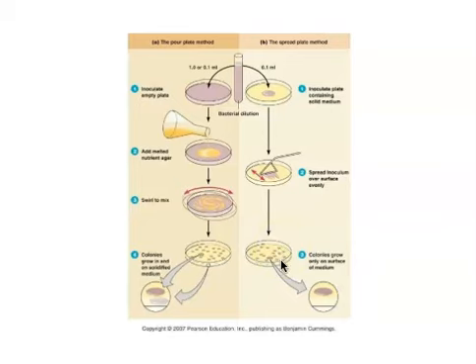So I cannot say with 100% certainty that each one of these colonies represents a single cell. Instead, I have to say that the colony represents a colony-forming unit. Most of the time, each colony comes from a single cell, but we're going to sort of hedge our bet a little bit and call them colony-forming units instead, as our best estimate of how many cells were in the original sample.